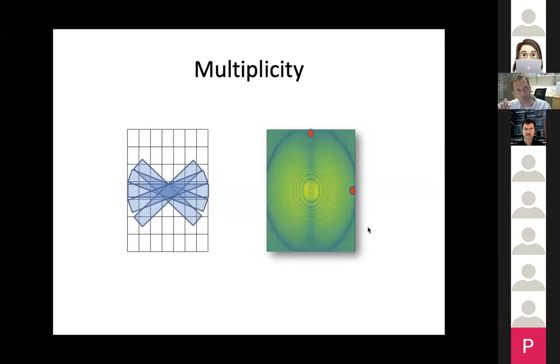So if you want to approximate this as well as you can under these circumstances, then it's no longer enough to give only a 3D Fourier transform with all these 2D slices in it and information about the CTF of those slices. You also need to bring along how often each pixel in the 3D Fourier space has been sampled by each of these 2D slices. Otherwise, you can't do these calculations correctly. So that's an additional term that has been added to the 3D pseudo subtomograms in RELION-4.